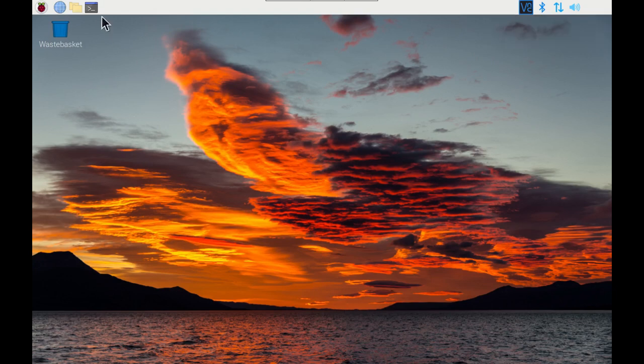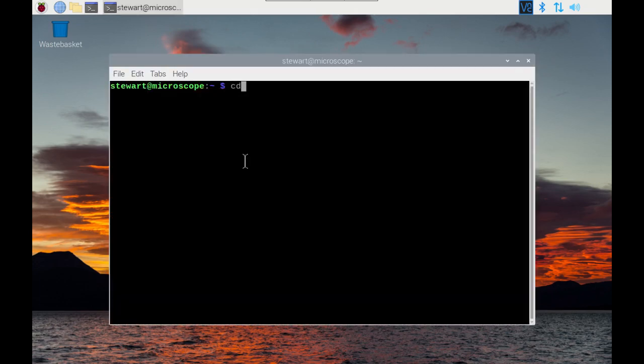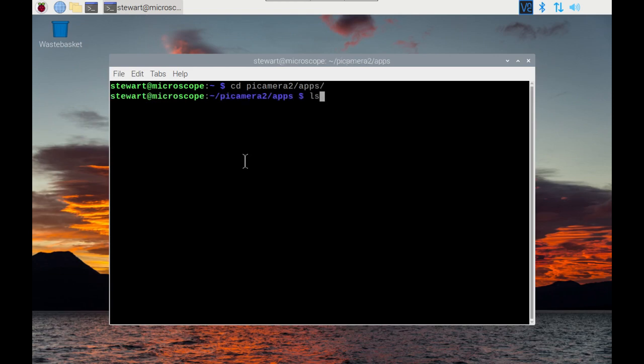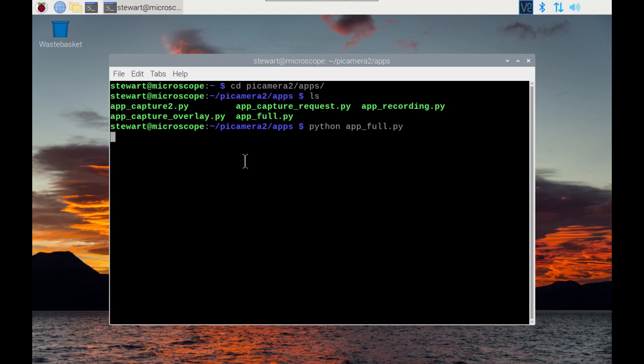Now that's rebooted we should be able to try that again. Get to Pi Camera 2 and the app_full.py.